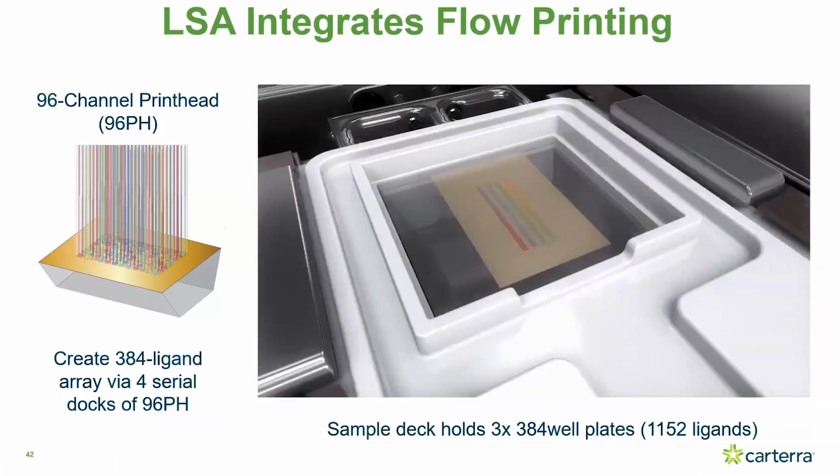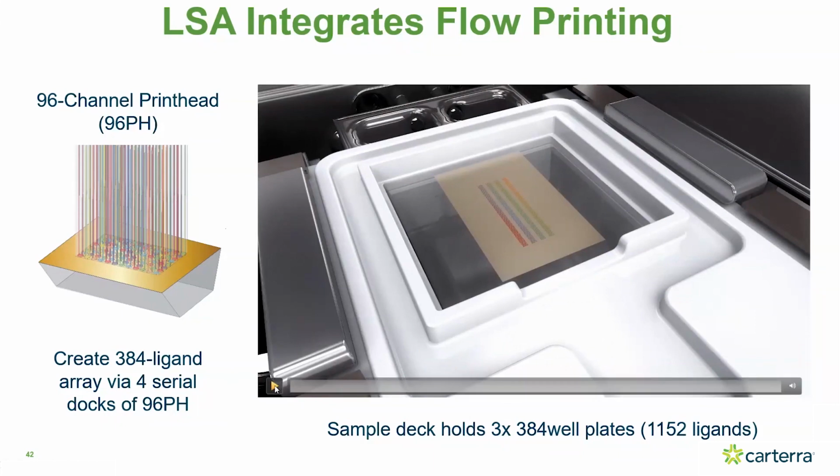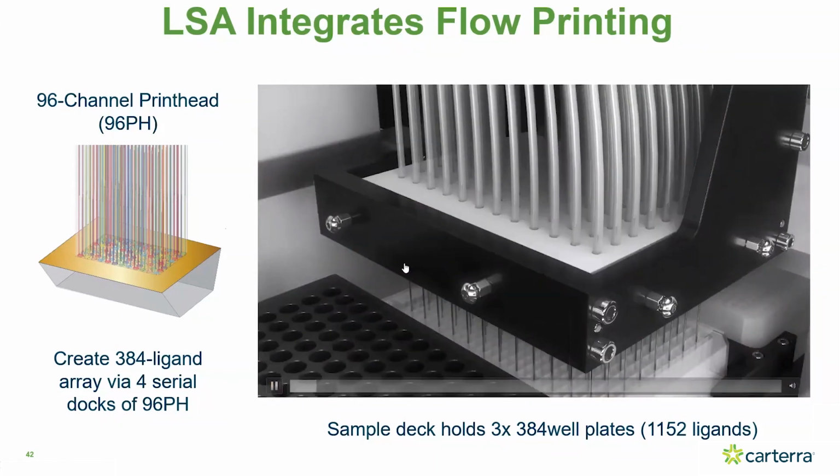The interesting aspect of the CFM is that, one, it flows the sample back and forth. So there is no flow rate to volume trade-off. So from that 200 microliter sample, you can capture for half an hour at a full flow rate if you want. Also, the sample is returned to the microplate after it's cycled, so you get the majority of your sample back.